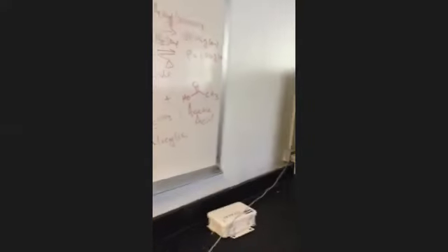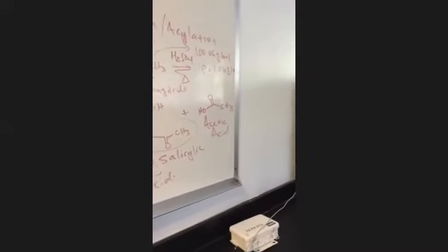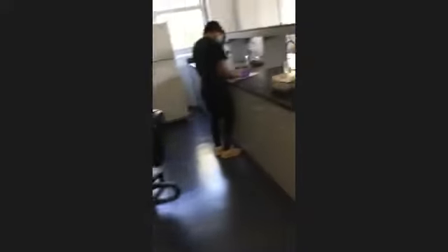Sulfuric acid was just 8 drops. You don't have to calculate the moles of that because it's a catalyst. And the actual amount for that wasn't calculated, correct? Yeah, it's just 8 drops. Then we can find the molecular weight, and you can look up the density for sulfuric acid. Yeah, just Google it. Okay, no problem. Thank you.